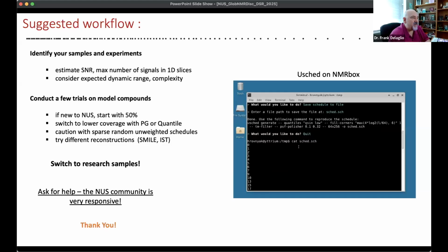In practice, you never have to choose these interactively. Once you know the sampling schedule, the Fourier transform of that sampling schedule tells you what the artifacts look like. So before you do any reconstruction, we already know how big the largest artifacts can be. And so we can always choose a threshold that's guaranteed to be larger than any of the largest artifacts.